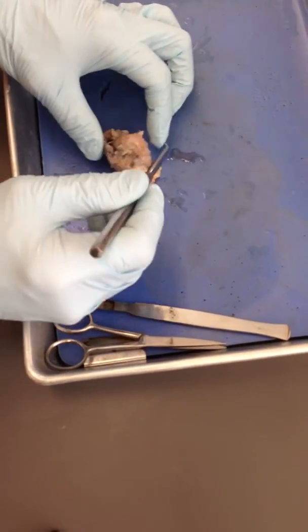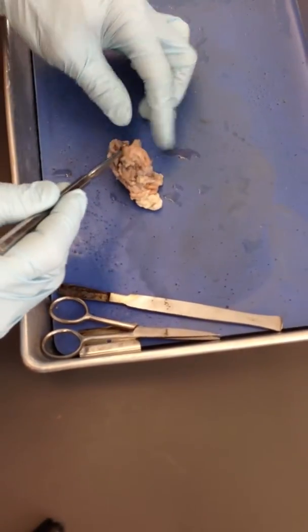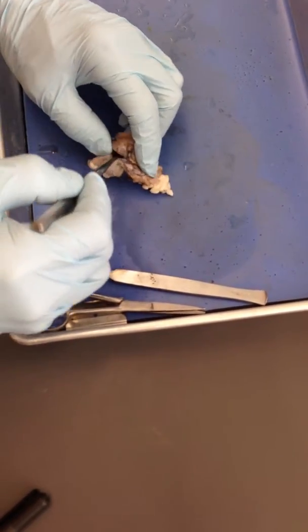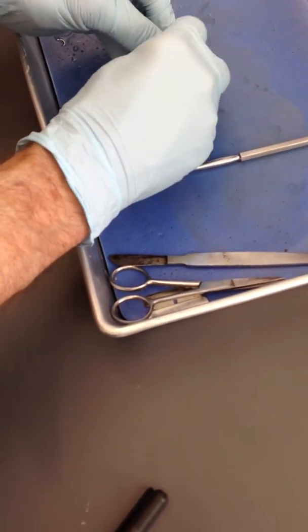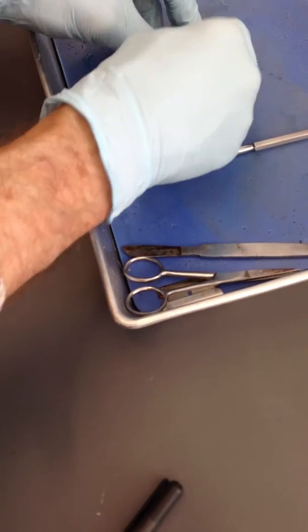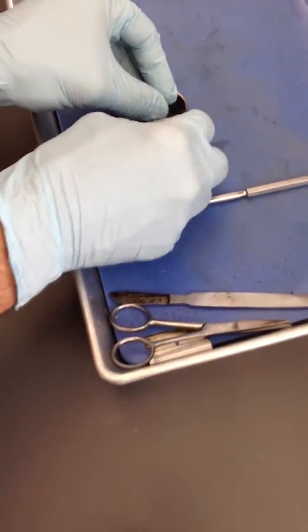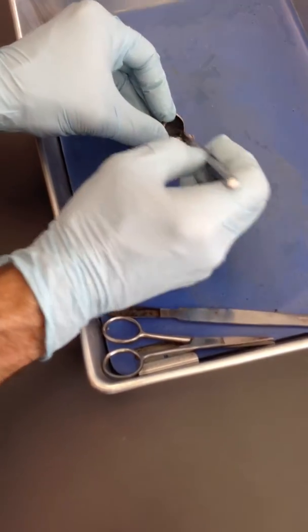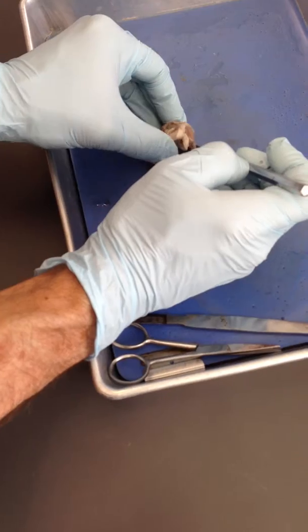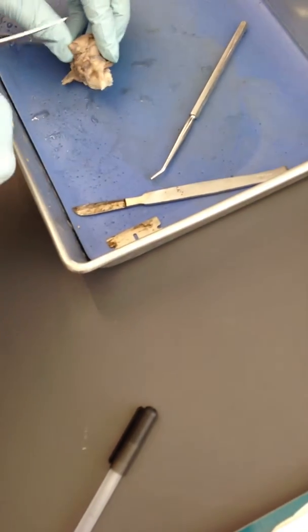So the axis of the eye: there's the nerve at the back, cornea in the front, and you guys did a nice cut here across the plane of the eye. As you opened this up, you probably saw a little bit of gel material, right? And that is the vitreous humor right here. It's rather jelly-like, isn't it? I'm going to just cut a little bit more. Just a little bit.